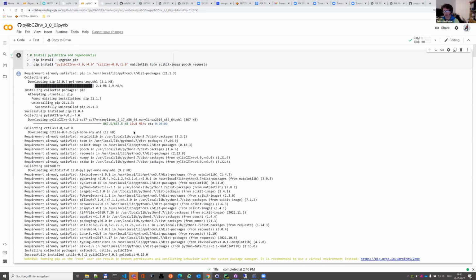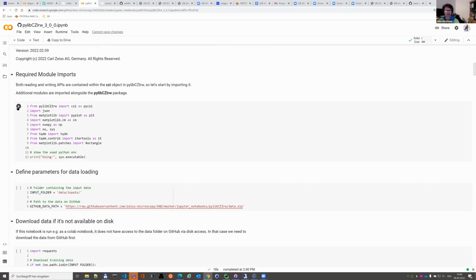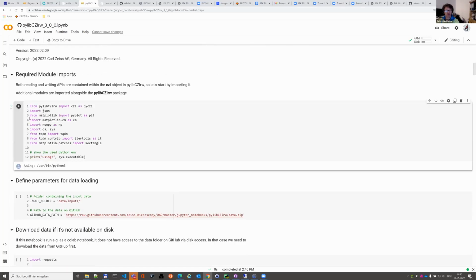Okay, that worked. Nice. So yeah, first the import, not too fancy. Here from PyLibCZI read-write, import CZI as, I called it PyCZI. And here some other packages that we will use later on.